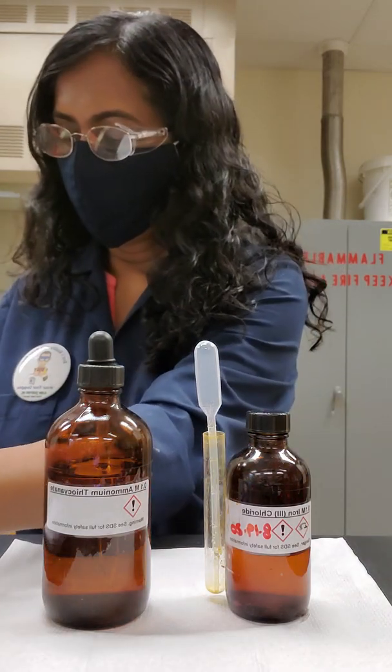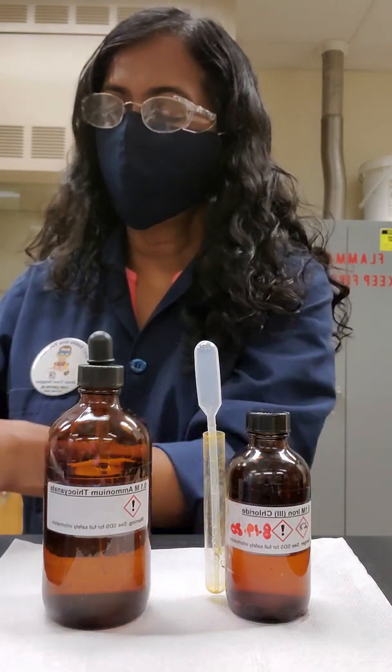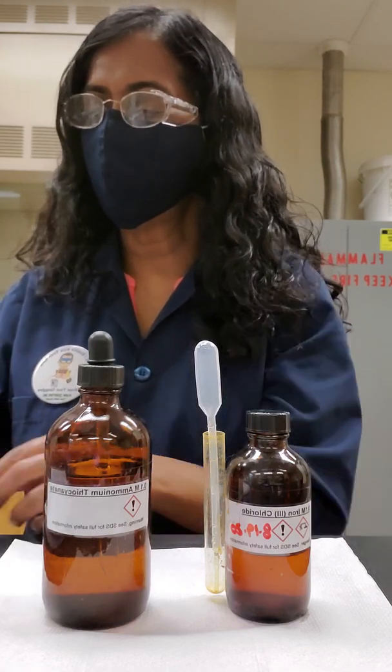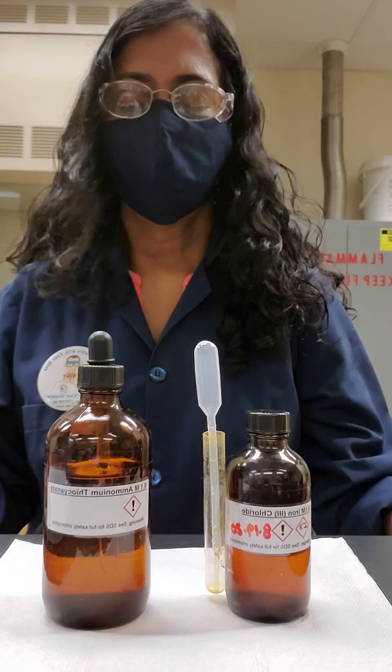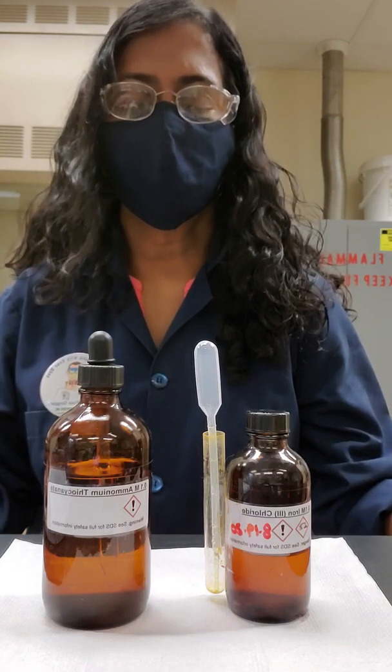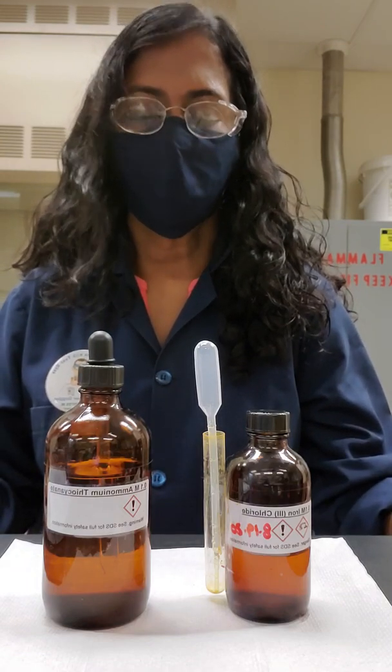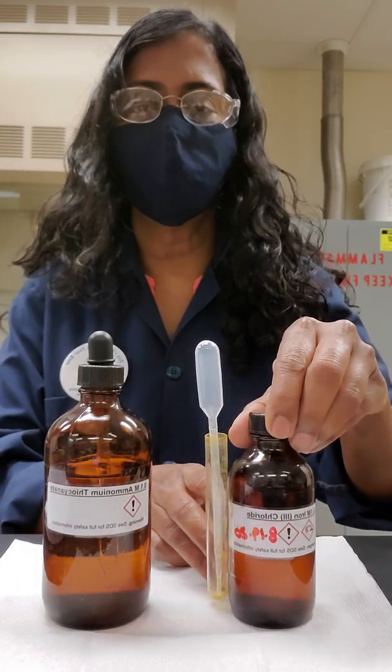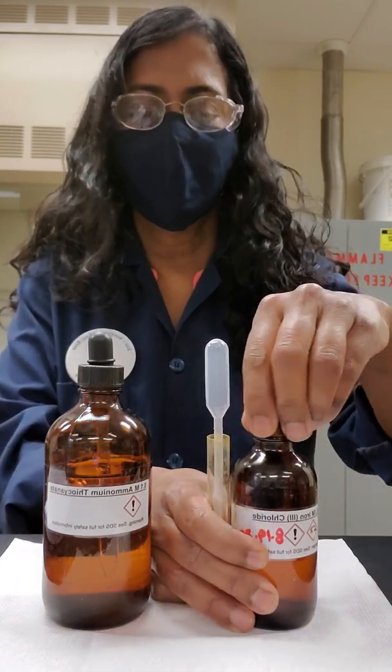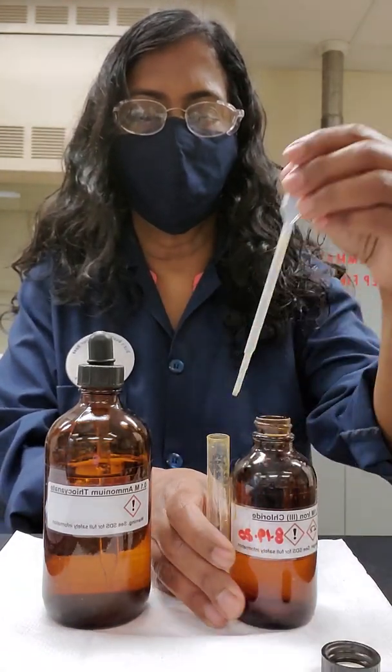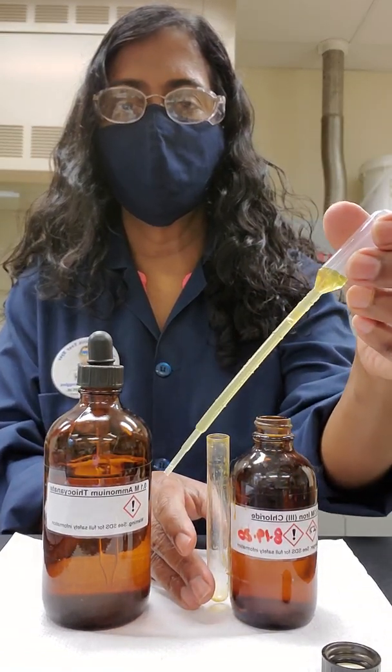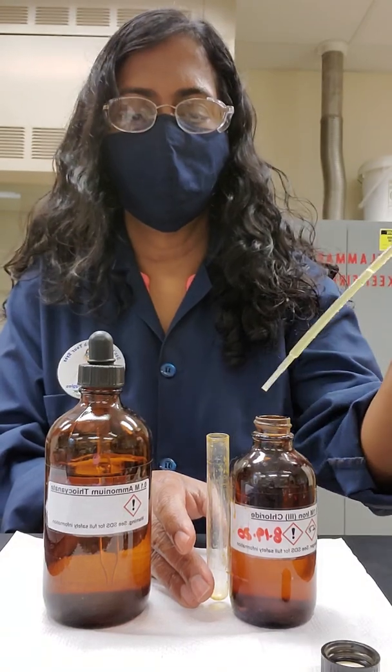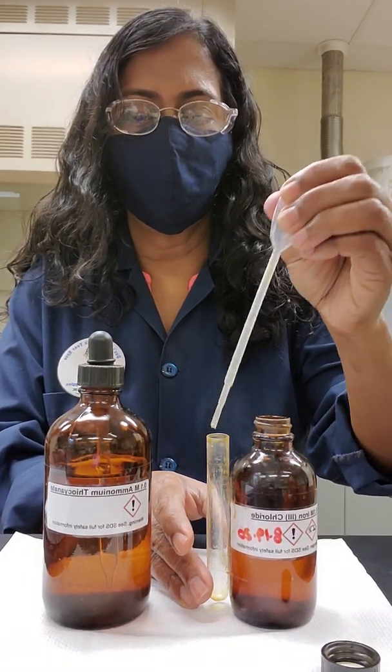If you turn to page 24, I'm going to go through the first experiment, which is an iron thiocyanate experiment. For this part, we have two reagents we are working with today. The first one is a solution of iron(III) chloride, which is in the small bottle. I'm going to show you the color of iron(III) chloride, which you want to record in your lab manual. Go ahead and record that in your lab manual.